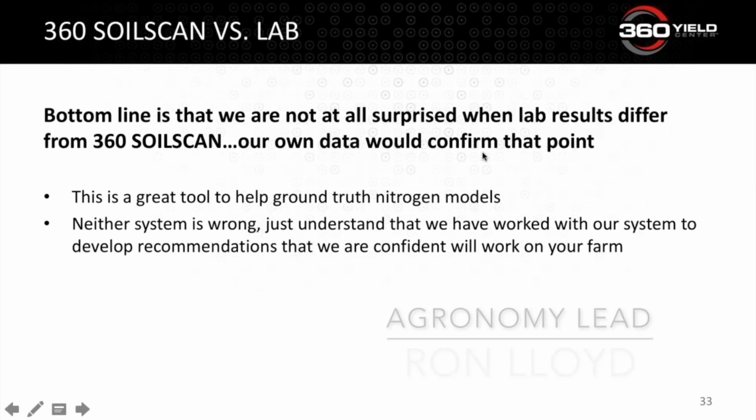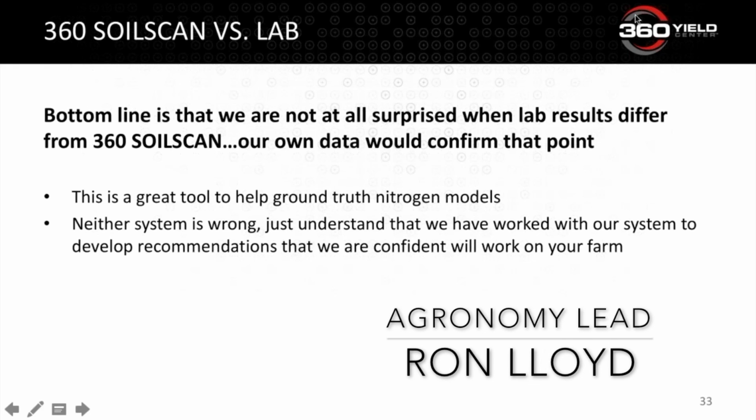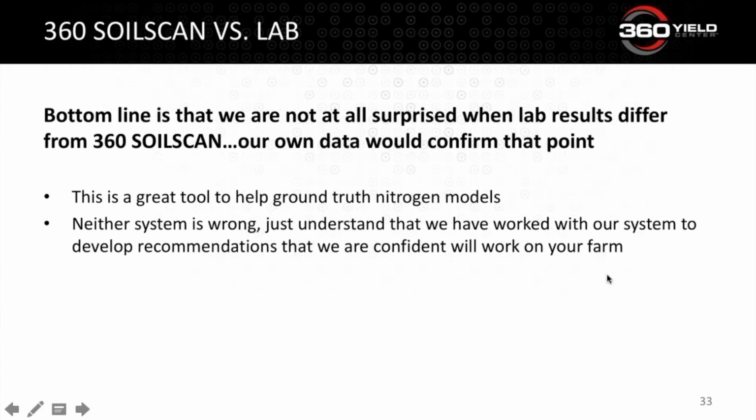Yeah, great job. The only thing I'd add is I believe that the confidence that we have in the SOILSCAN machine is when we're taking that fresh right in the field, we're taking out that variability of handling. And that's where I think that difference is, like you said, and I agree, it's not that the tools at either the lab or the SOILSCAN are bad or wrong. They're getting the right reading for the soil that they're testing. But when we test in the field fresh, before we've allowed it to mineralize and do things unnaturally, it goes back to what Matt talked about.